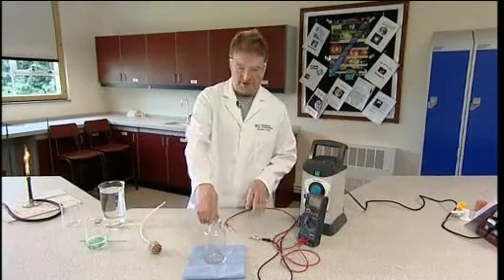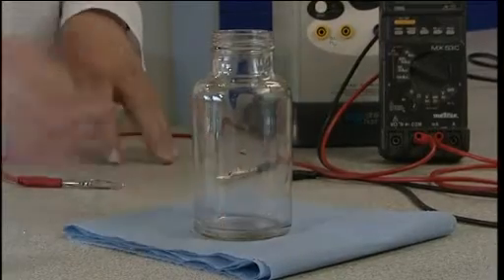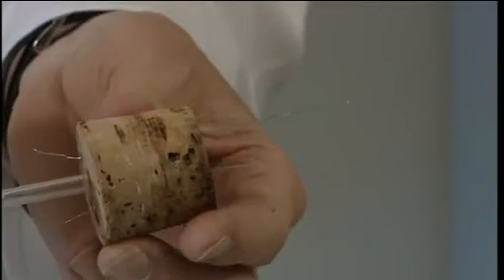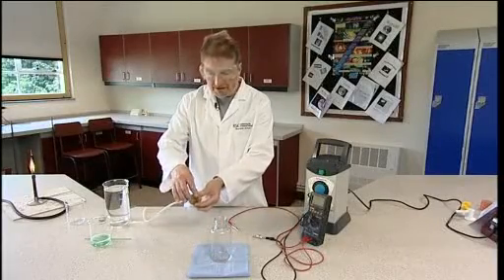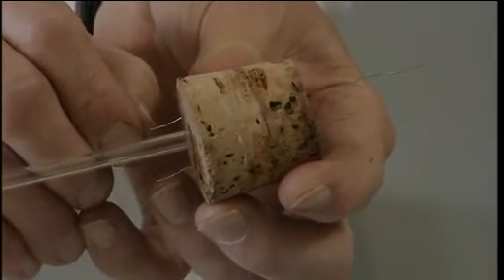This is the apparatus that we use. This is a 400 cubic centimetre powder jar, and this is the electrode assembly. It's a cork, sized to fit the powder jar, with a single hole and a flexible delivery tube, and two platinum electrodes which are inserted through holes previously bored in the cork.